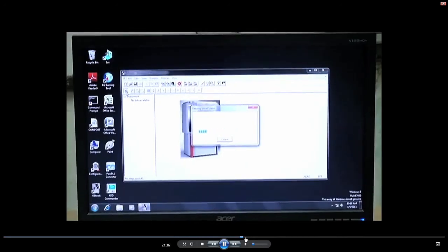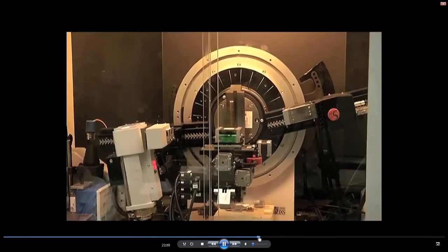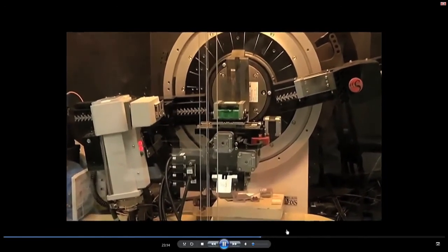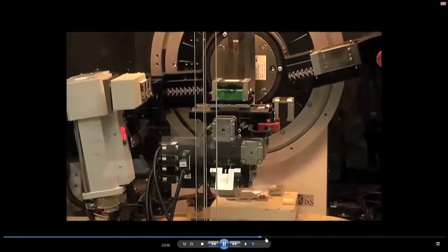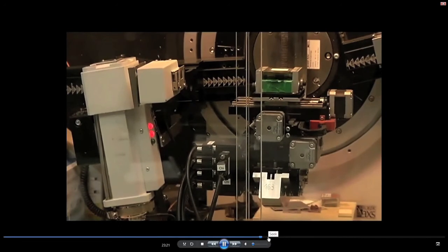The data collected from the instrument is completely analyzed by the interface software, and we will show you what kind of data you get, and how the background and everything is filtered by the software, and then you can have a look at it. So let the fresh experiment start with all the possible 2 theta angles.